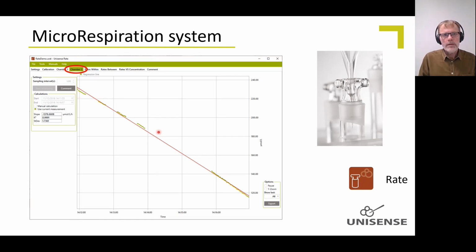The way the software works is that you can measure, you can see the concentration change here, oxygen decrease during the measurements. In this case, there's been 2, chamber 1 and chamber 2 here. The oxygen concentration has been read several times, and there's breaks in between where the sensor has been used in the other chamber. Whenever you're doing measurements, you will immediately see the slope, so micromoles per liter per hour change here, you'll see an R² value and the standard deviation, so you can see the quality of your data and see for how long you need to measure to get good data.